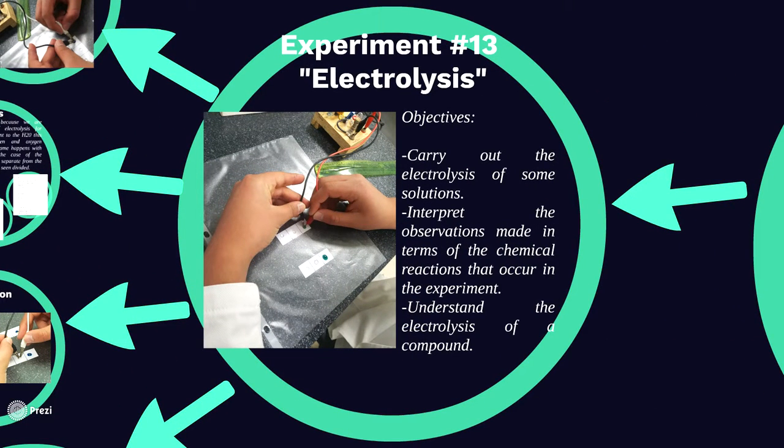Experiment 13. Electrolysis. Objectives. Carry out the electrolysis of some solutions. Interpret the observations made in terms of the chemical reaction that occurred in the experiment. Understand the electrolysis of a compound.